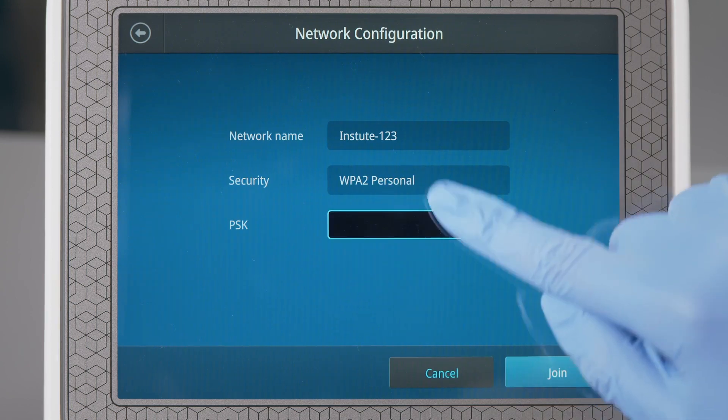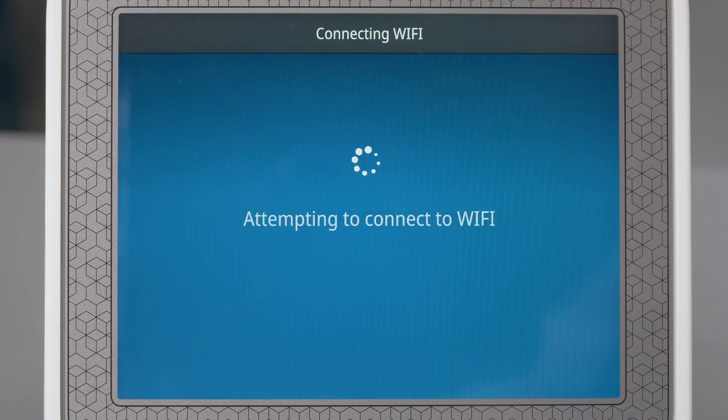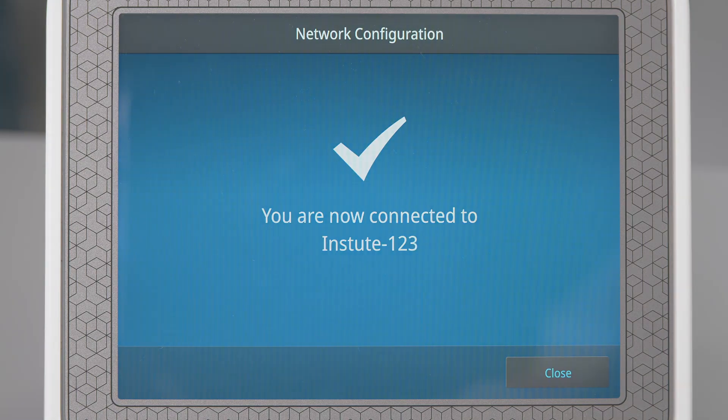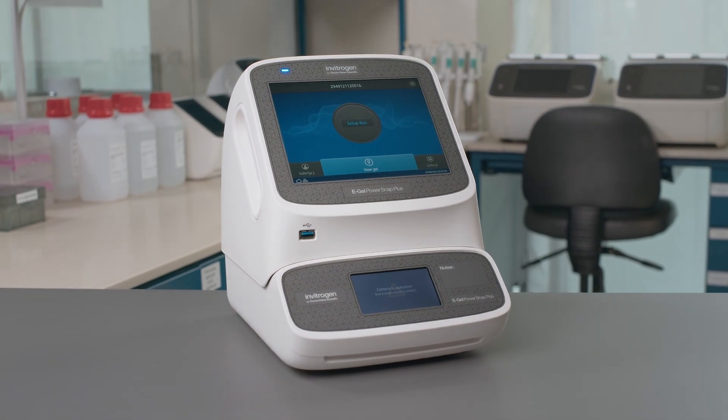In the PSK field, enter the password to join the network. Press Join. If all the entered information is correct, the Network Connection Complete screen will appear.